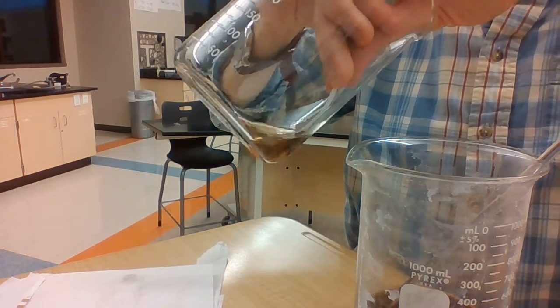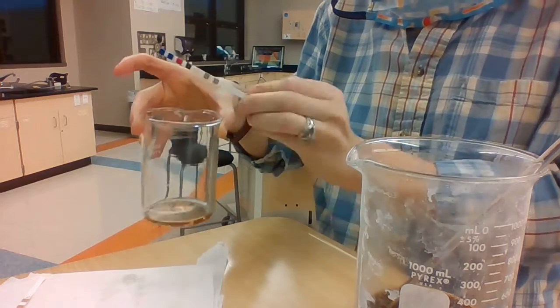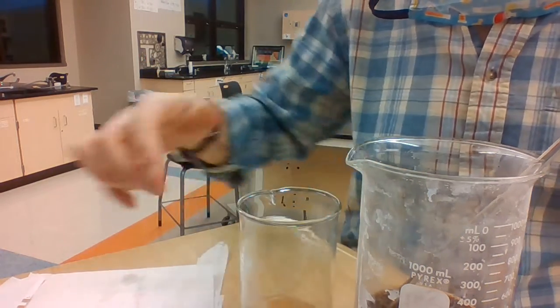I'm going to dip the test strip all the way into that water and give it a little shake, set it here for 30 seconds, and then I will come back.